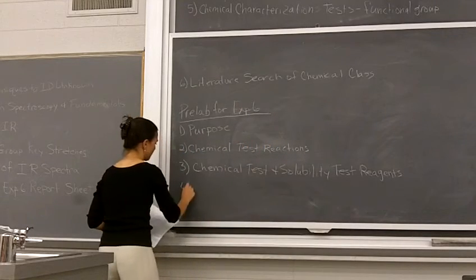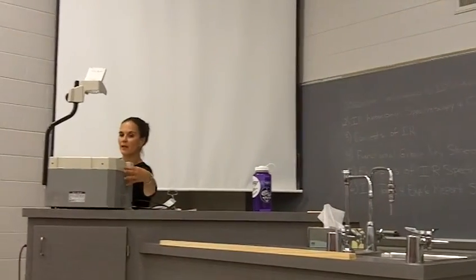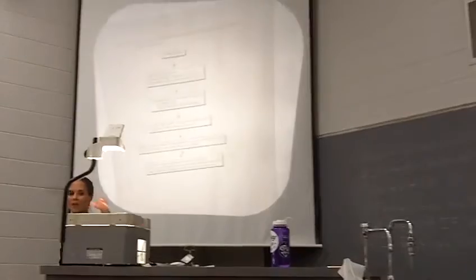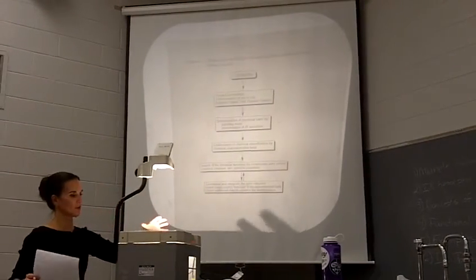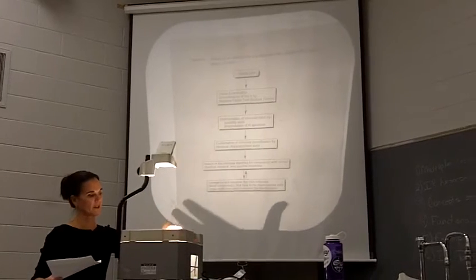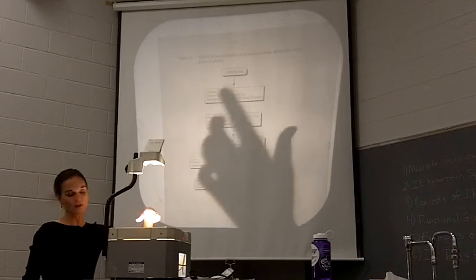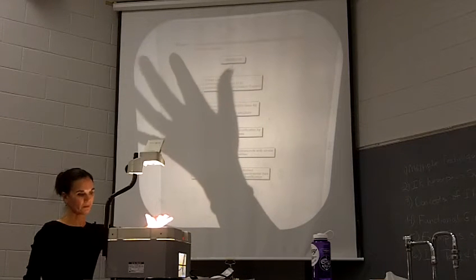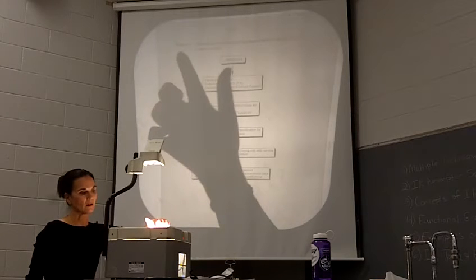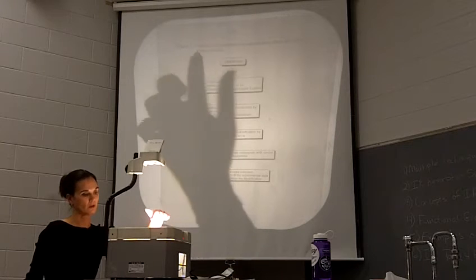You're going to have a flow chart, and the flow chart is unlike other flow charts where we focus on having these branched arrows and showing all the separations for the workup and so forth, because this is a different type of experiment. Your flow chart is in your lab manual on page 612. Or figure, actually I believe that page number is wrong. Look for figure 6.2, okay?